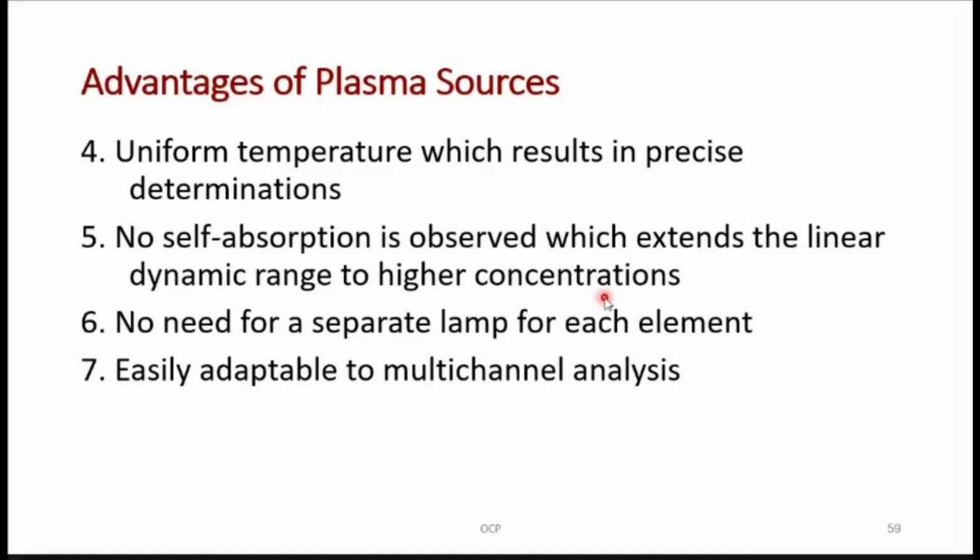If you go on increasing the temperature in the flame, the other atoms which are not that excited because of comparatively lower temperature, comparatively lower energy, will start absorbing the emitted light by other excited atoms.